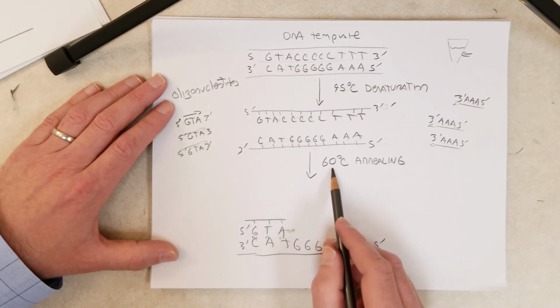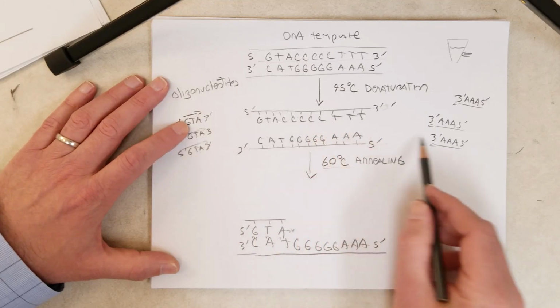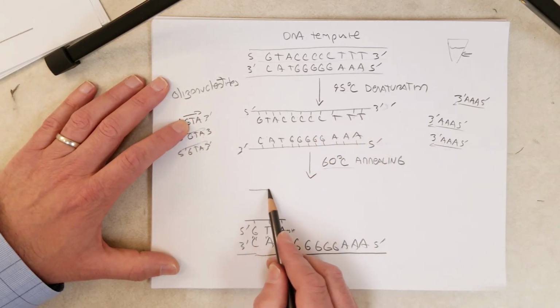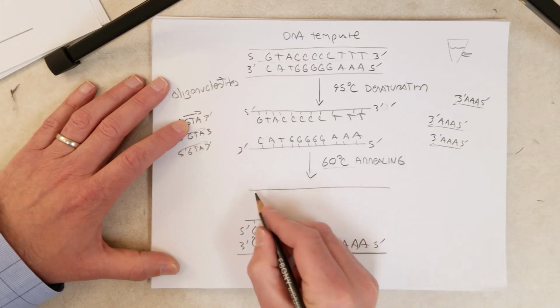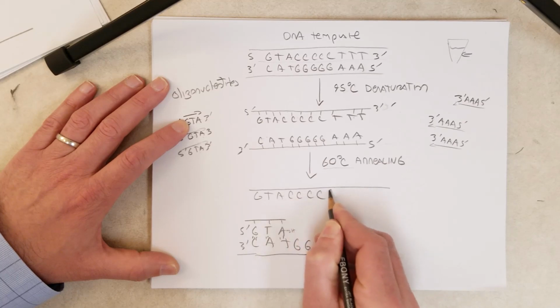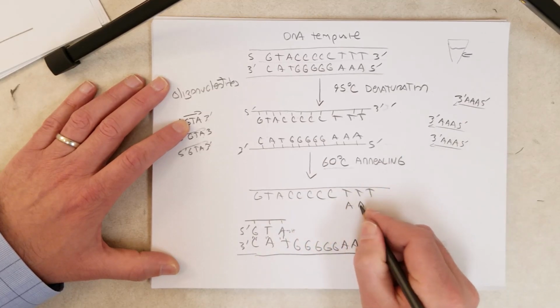But it's not going to because the polymerase doesn't work well at this temperature. But let me show binding of the reverse primer to this strand first before we go on to the next step. So GTACCCCCTTT, AAA.